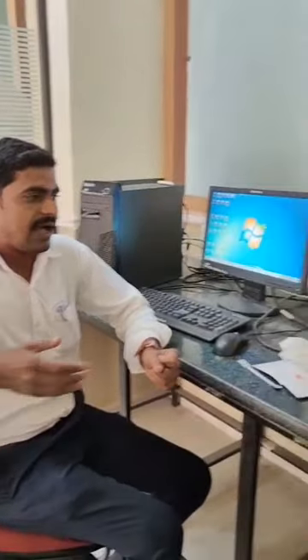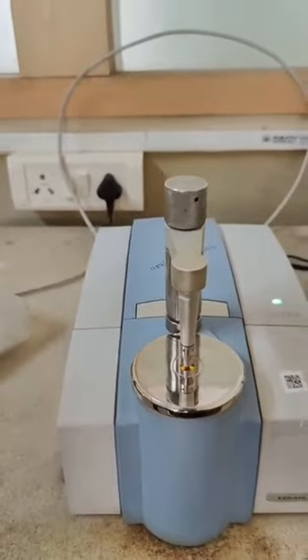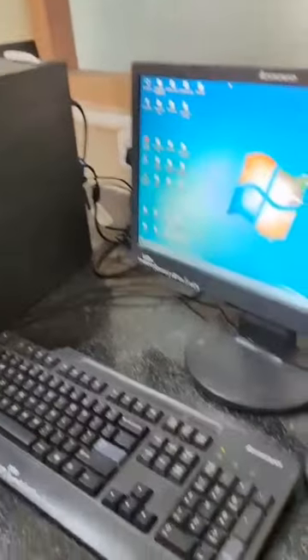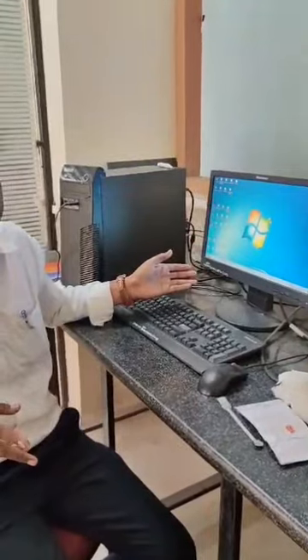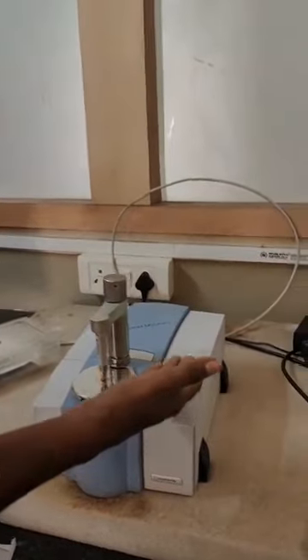Welcome to the world of pharmacy. Today we will see how to operate the IR instrument. This is the EPOADR IR, made by Bruker — one of the topmost IR instruments used throughout the world, made in Germany and connected to a PC. First, we need to start the computer, and then start the instrument. You can see the instrument is started — all green lights.